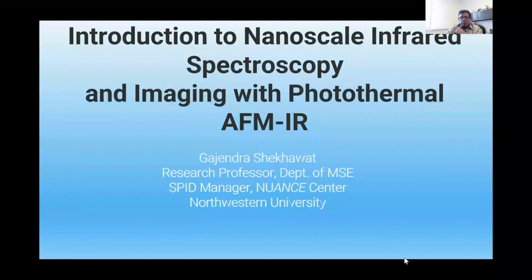So I will talk pretty quickly about the Nanoscale IR system that we installed late last year in the facility. It's a combination of both Nanoscale IR and Photothermal IR. Basically, they are the same technique but two different names. A lot of people ask me, can we do photothermal, can we do nano IR? So I think this would clarify that there's no difference.